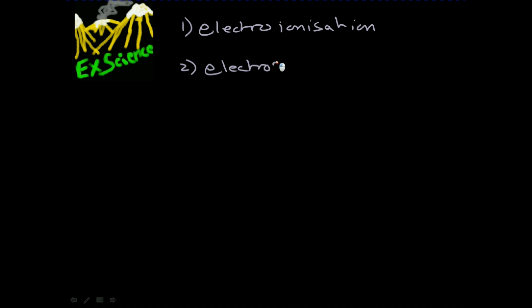We will briefly look at two ionization techniques, although there are several others. One is electron ionization, and the second one is electrospray ionization.